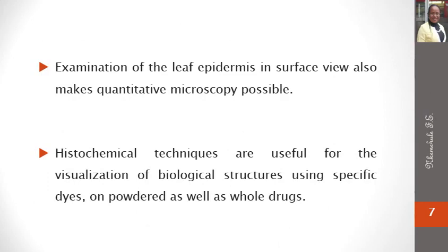Examination of the leaf epidermis in surface view also makes quantitative microscopy possible to determine the stomata number, stomata index, vein islet number, vein termination number, as well as the palisade ratio. Histochemical techniques are useful for the visualization of biological structures using specific dyes, both on powdered and whole drugs.